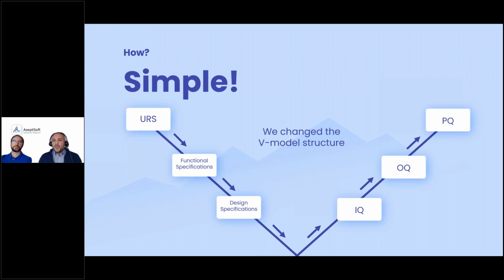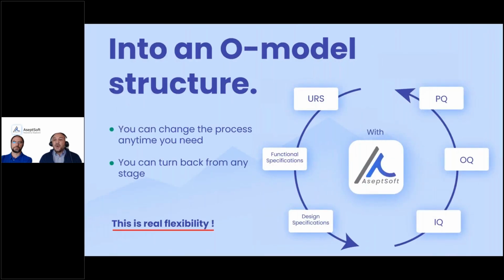You all know that it takes less than an hour to weld a valve, but it's so difficult and time-consuming to modify the documentation. With AseptSoft, we like to say that we changed the Pharma documentation V model concept and turned it into an O model concept, because with AseptSoft, you can modify the process very easily and fast, and you can quickly regenerate the new technical documentation.